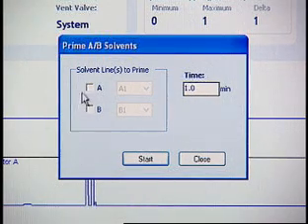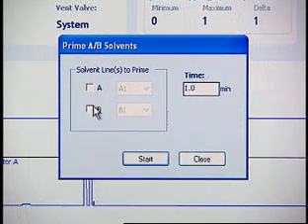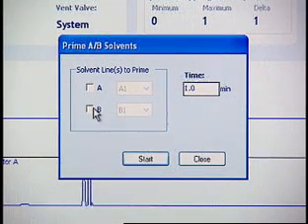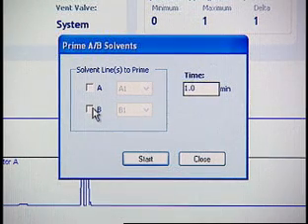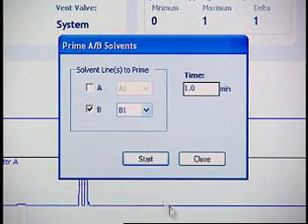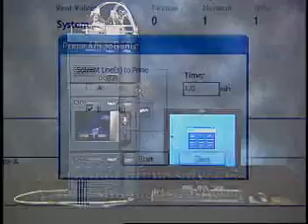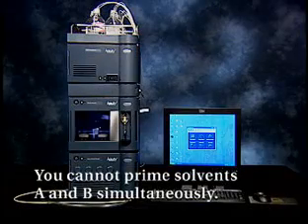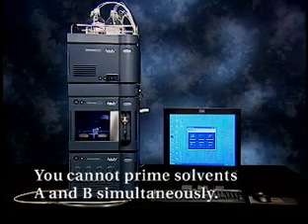Select Solvent A or B and then complete these selections. If you selected solvent A, select either A1 or A2. If you selected solvent B, select either B1 or B2. When priming with a syringe, select only one solvent — A or B. You cannot prime solvents A and B simultaneously.